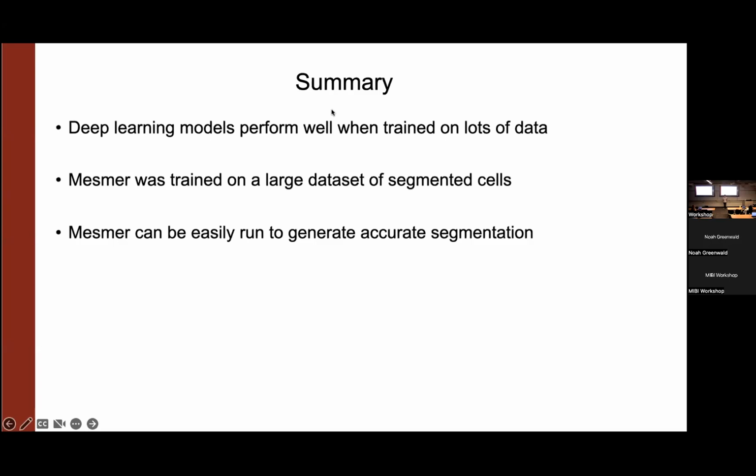So what you need to do is think about, what are the specific questions that I want to answer with my analysis? And are the inaccuracies in the pipeline going to prevent me from answering that question? And if the answer is yes, then you either have to change your question or change the pipeline. But it shouldn't just be, oh, I looked at the images and I don't really like the output. That is not a good platform for deciding to do a 1-year project of algorithm development. Optimistically 1 year.